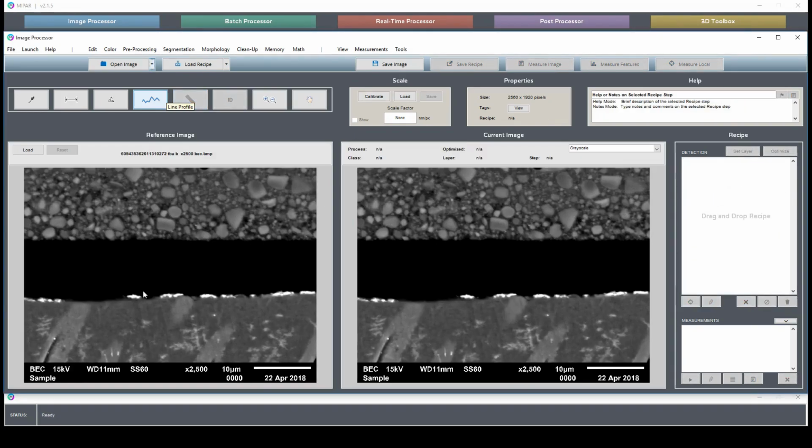So what we're looking at here is dentin, so this is a tooth, and here we have adhesive between the tooth and the compound used to fill a cavity. So here along the adhesive dentin boundary we have silver ions, and what these do is show where there's been gaps between the adhesive and the dentin, where that adhesion process didn't work properly. So these silver ions will infiltrate these gaps and highlight them.